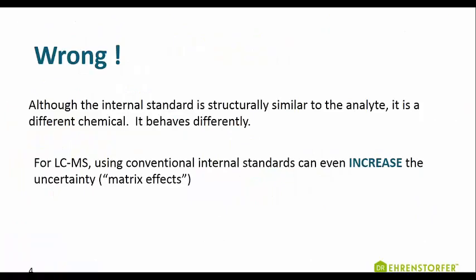Well, unfortunately not, or this would be a very short webinar. The internal standard, though similar, is still a different chemical. It behaves differently. But for LCMS methods, there's also a very specific problem. Using a conventional internal standard can often be worse than using no internal standard at all.